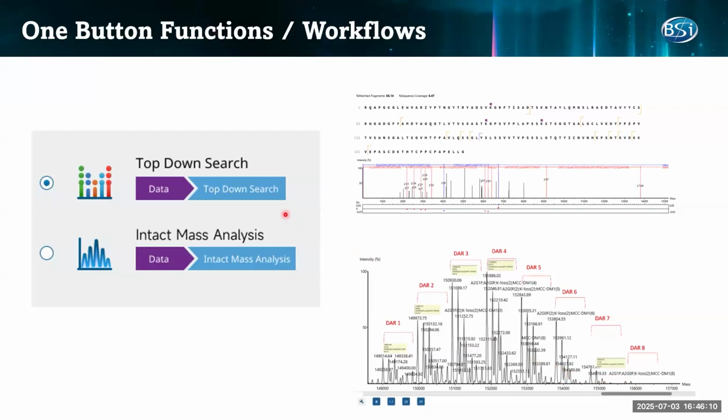And above that is the top-down search. On top of those, we have tandem spectra for some precursors of those proteoforms. Here is one example, a proteoform we detect, actually an FD part, and in this case three drug sites were identified based on those top-down fragment ions.